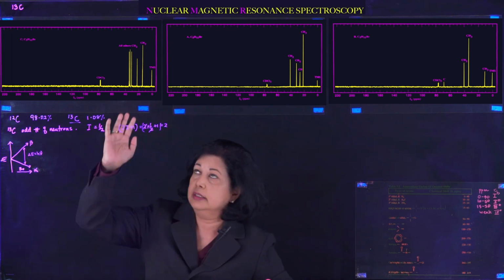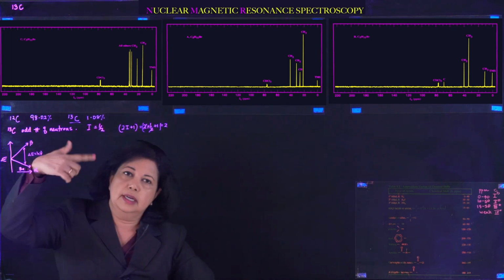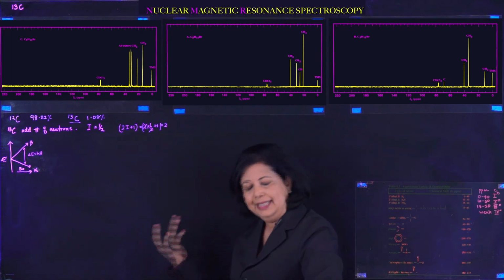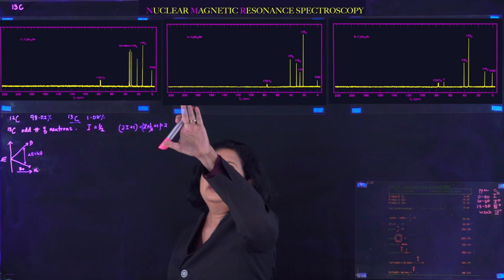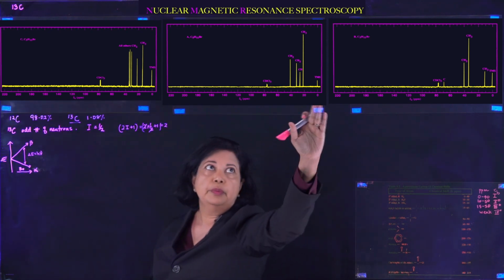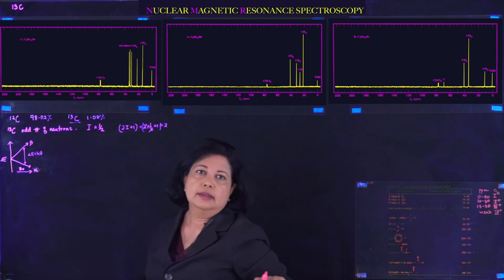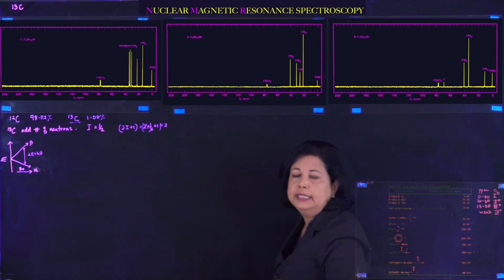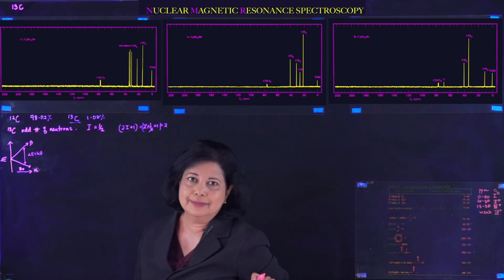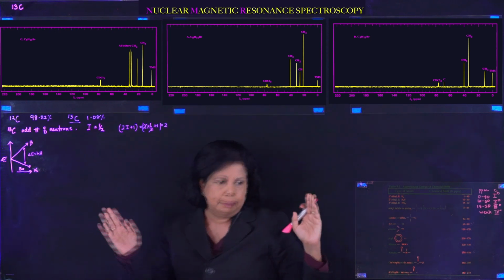Obviously, if you have very concentrated samples, then you have a lot more resonance, and you would have a stronger or intense peak. So over here would be your intensity, and over here would be the shift, chemical shift from TMS due to electron withdrawing groups or other functional groups. Okay, so that's just a little blip about carbon-13.